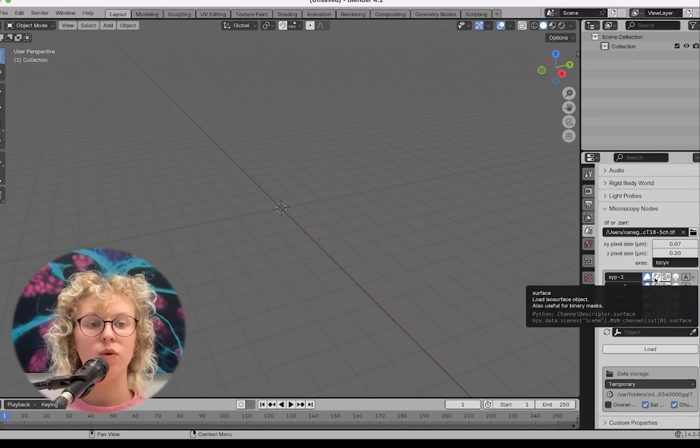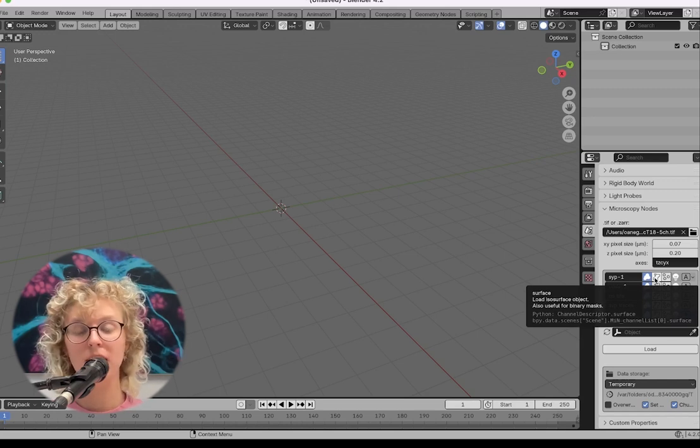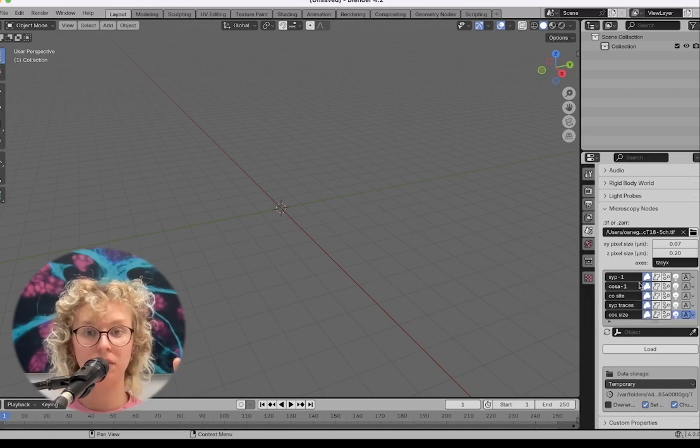Usually you want either this or the second one, which is an isosurface, which is a process where you threshold the image. At the threshold, you make it into a mesh, and you just make a surface at that threshold and then see what the data looks like then.